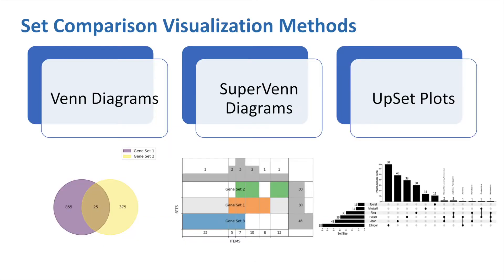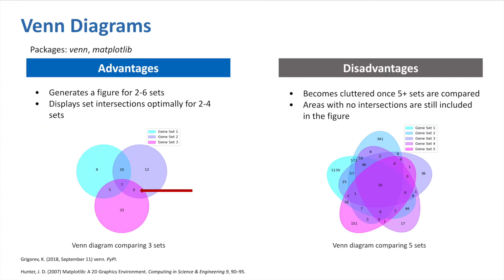There are three visualization options available in the Aperture: Venn diagrams, super Venn diagrams, and upset plots. Venn diagrams can be created to display the intersections from 2 to 6 user-inputted gene or drug sets. However, Venn diagrams are best suited for when you want to compare 2 to 4 sets, since visualizing them is really clear and easy to understand. Once you start comparing 5 or more sets, the Venn diagram often becomes really cluttered.